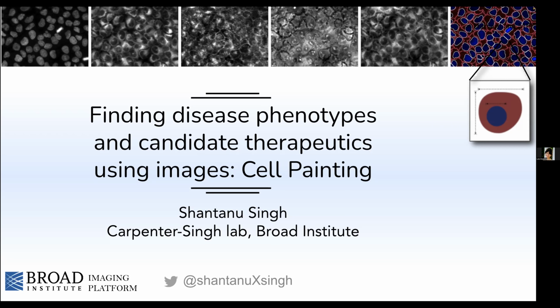So today I'll talk about how our lab at the Broad is using microscopy imaging and machine learning to address many problems in biomedicine and drug discovery. I will focus on the broad topic of how we extract information from millions of images of cells to characterize cell state, and then show you examples of how we can use that information in biomedical research at large, and more importantly, how to use that to find new drugs for diseases. I plan to leave plenty of time at the end, at least 20, 25 minutes, so that we can have longer discussions, but please feel free to drop questions into chat, and we can take them at the end.